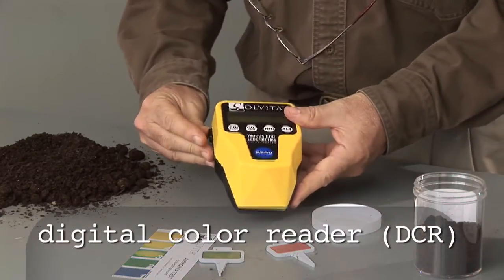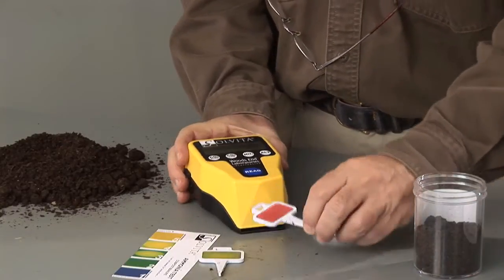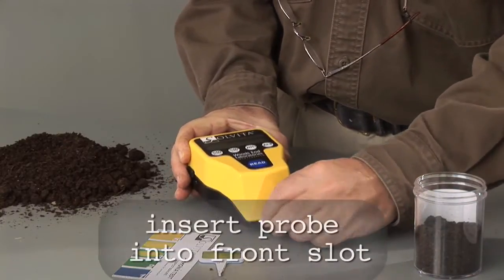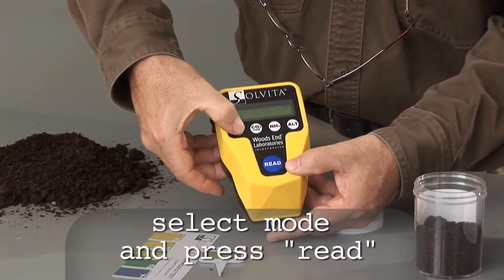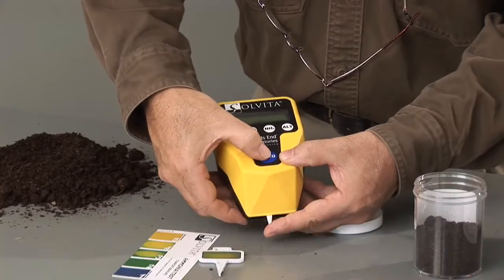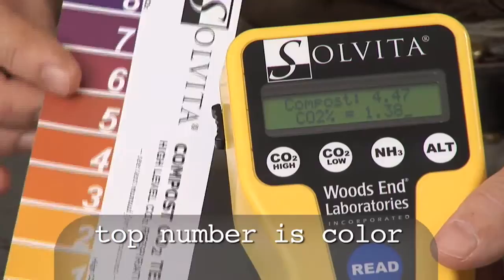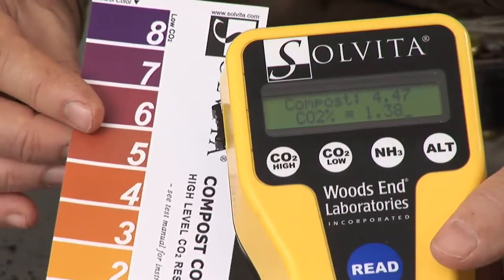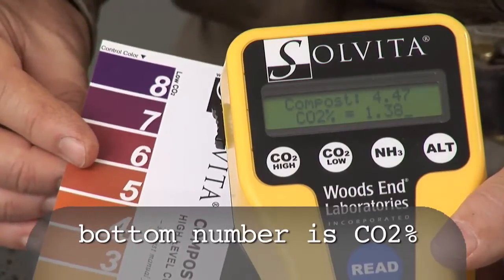For persons interested in a more precise reading of the Sylvita colors, we have the digital color reader. This device enables you to read the colors very accurately. We insert the test paddle into the DCR, select the CO2 button, and do the reading. The top line on the digital color reader indicates the same color number we already determined on the visual color chart, but more precisely. The bottom number indicates the CO2 content in the sample.